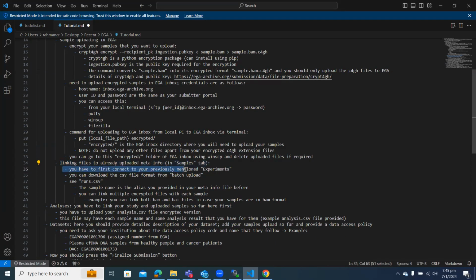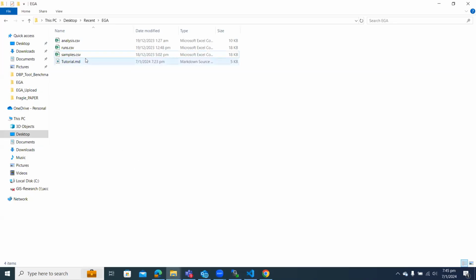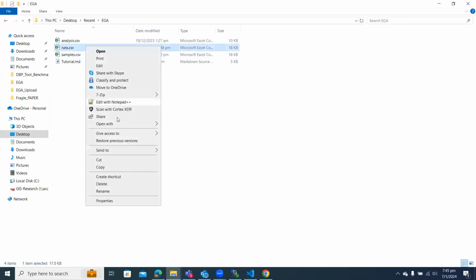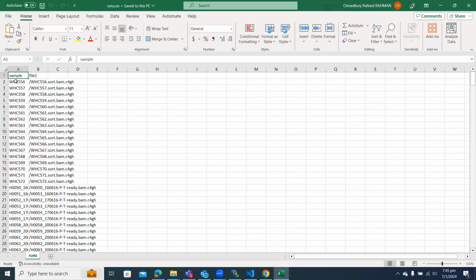These things I have already mentioned here. So let's see what the batch upload file looks like. Okay, let's go here, runs.csv. So you have the sample.